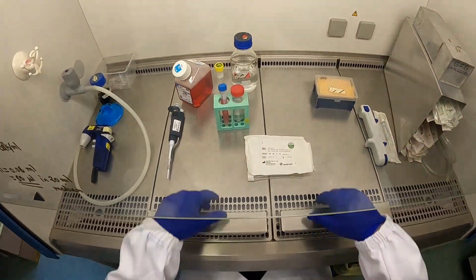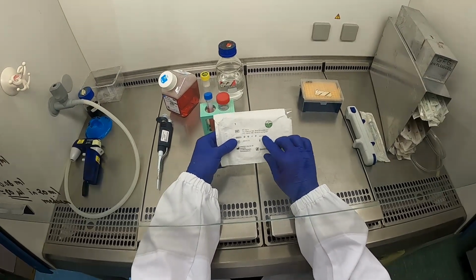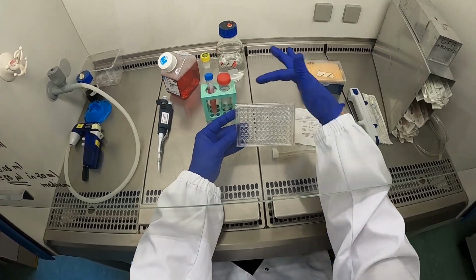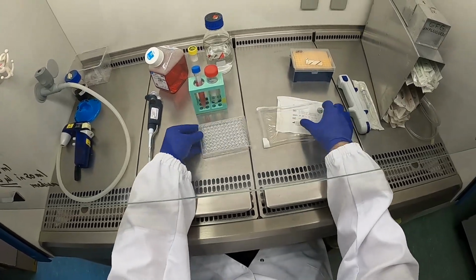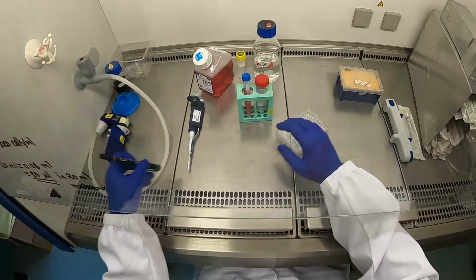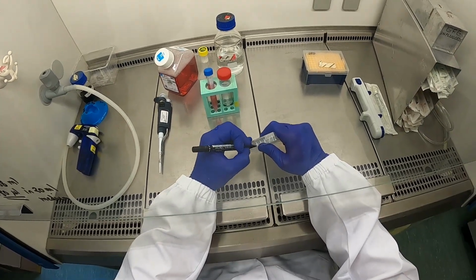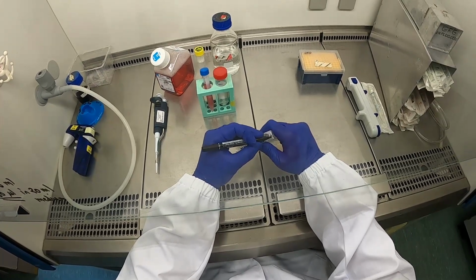Okay, so let's get the 96 well plate, which is sterile, get it out of its package. There's a left and a right side, and you recognize the left side because it has the corner. On the left side you also see A, B, C, D, E, F, G, H, and on top 1 to 12. Label it. Make sure you have your name and date on it. Maybe even a description of the experiment.